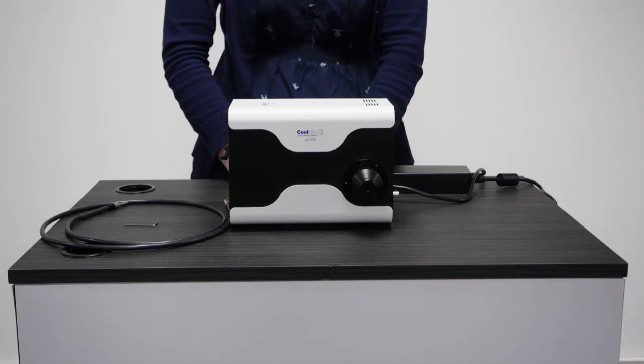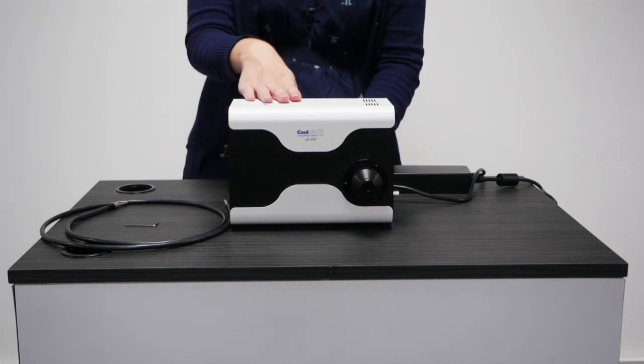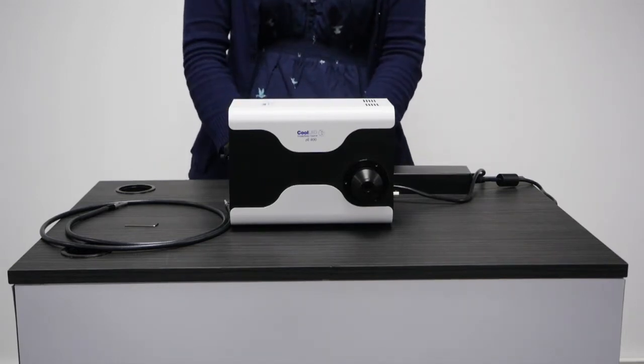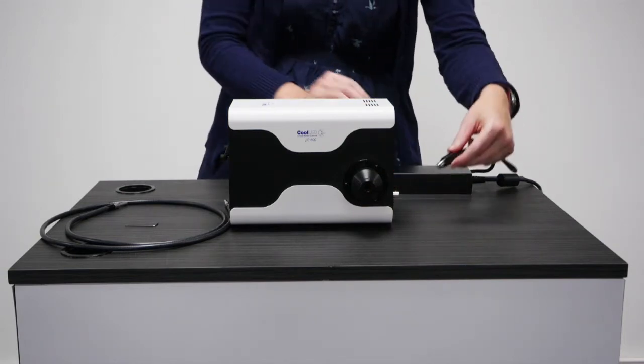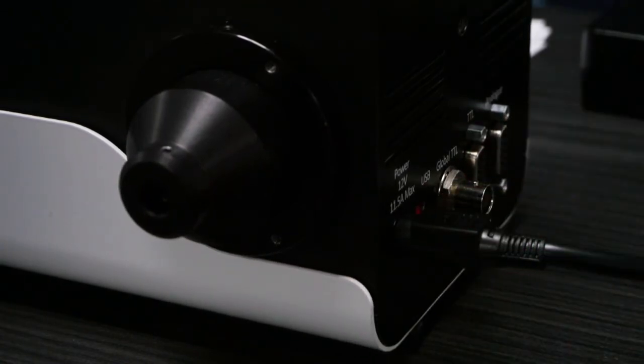In this video we will show you how to fit the 8-channel pE-800 to a Nikon Ti2 microscope. Once you unpack the components, insert the power connector from the DC power supply. At this stage, however, do not yet connect it to the mains.